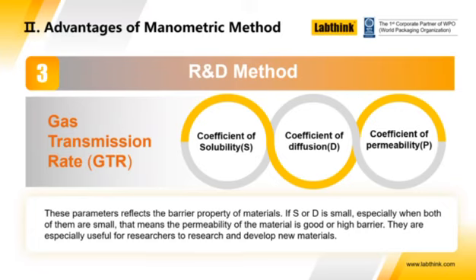The difference is that one is a true sensor-based system, which is the coulometric. It relies on the coulometric sensor, whereas the other one is a scientific method. It follows established laws of gas physics, and so it's a very traceable method.